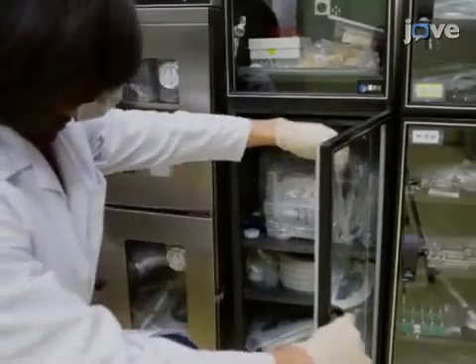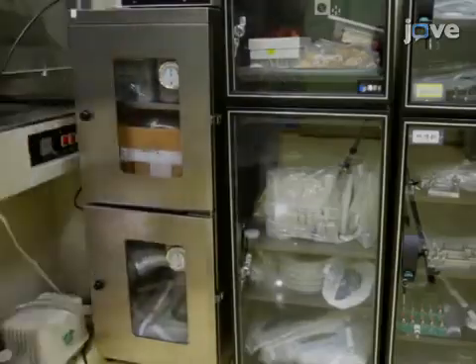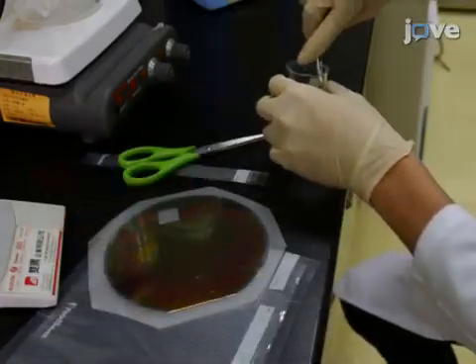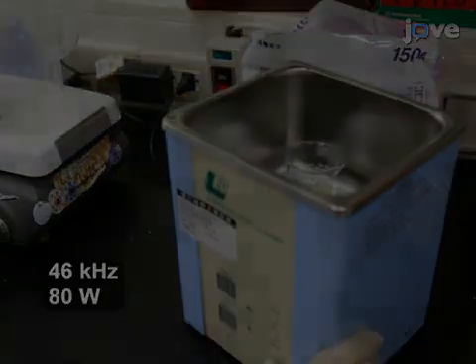To pre-treat the device, first remove it from storage in an electronically dry cabinet, and open the sealed vacuum bag that contains it. Clean the biosensor in a sonicator loaded with pure acetone for 10 minutes.